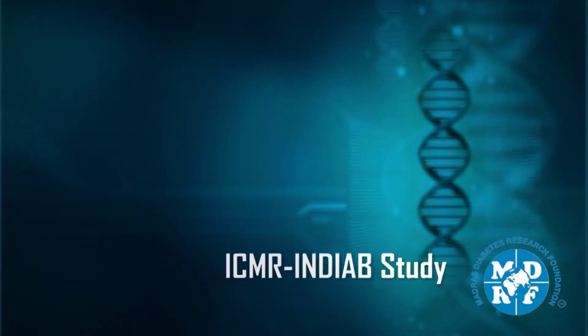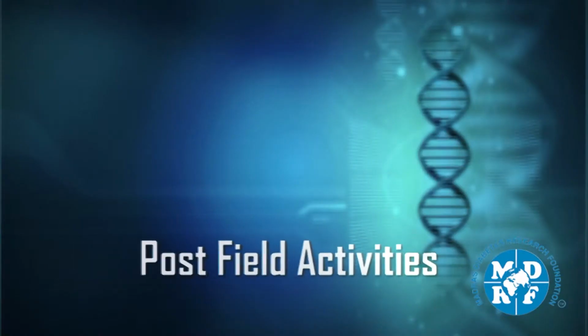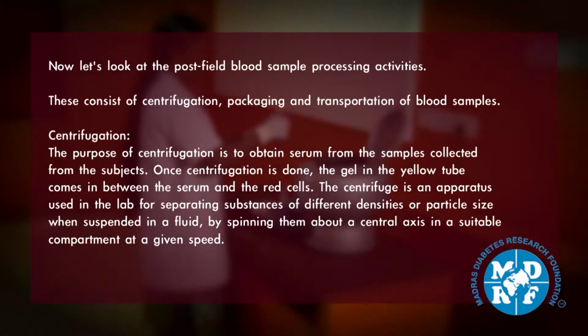ICMR INDIAB study, post-field activities. Now let's look at the post-field blood sample processing activities. These consist of centrifugation, packaging and transportation of blood samples.